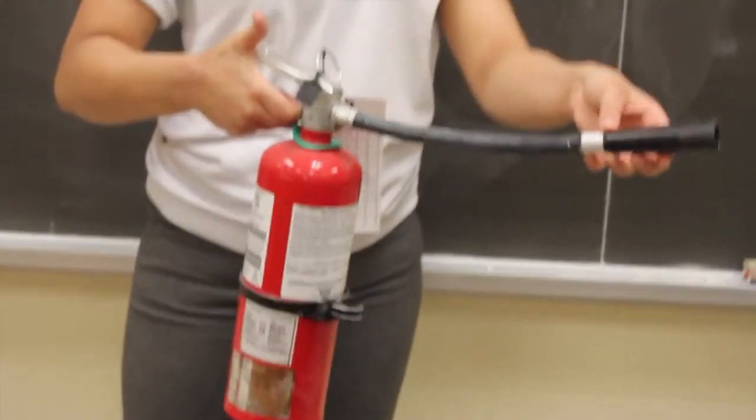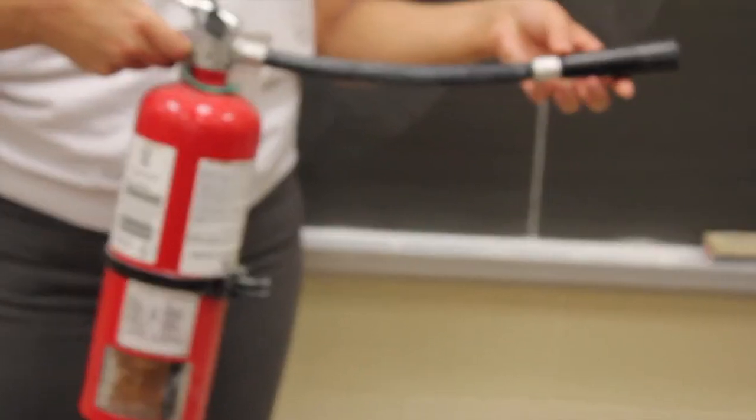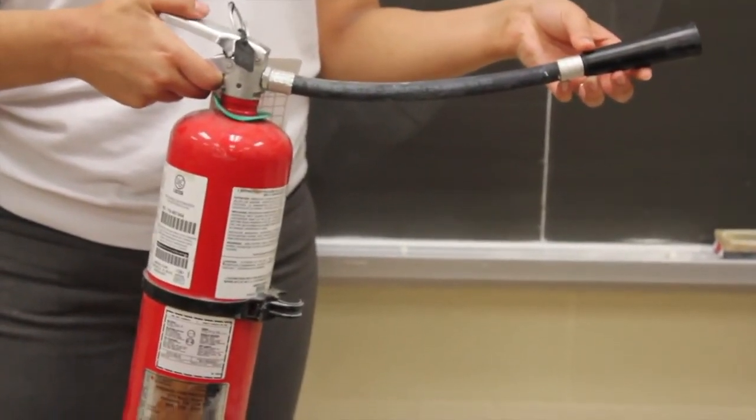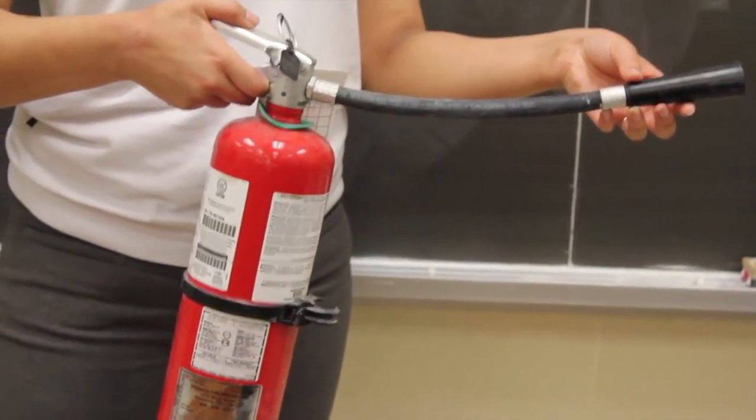In the case where a fire is too large to contain, everyone must evacuate the room and the fire department must be called. Upon calling them, it is essential to tell the fire brigade which chemicals were involved in the fire.